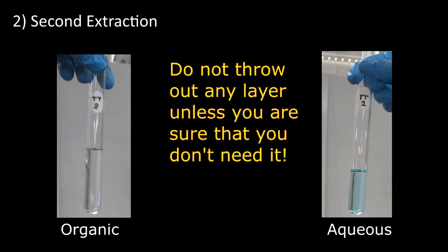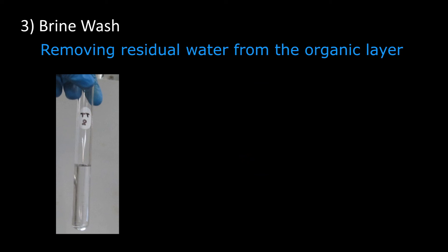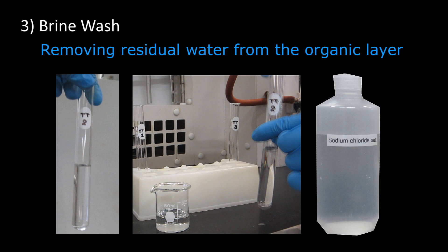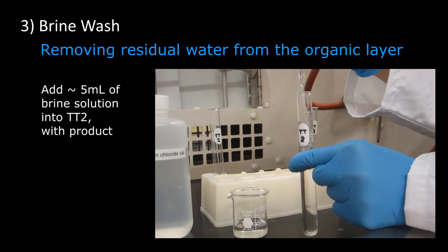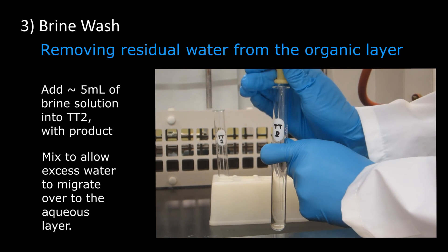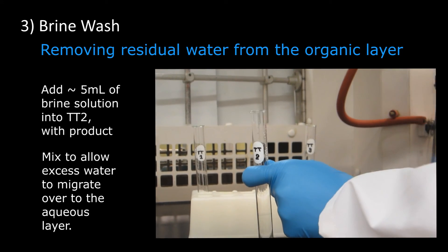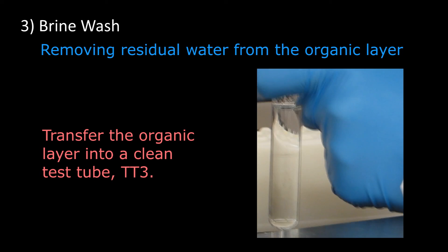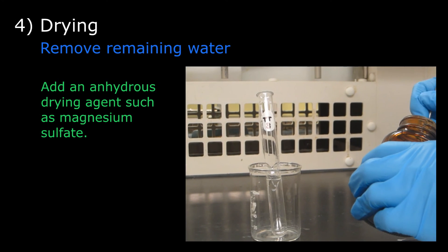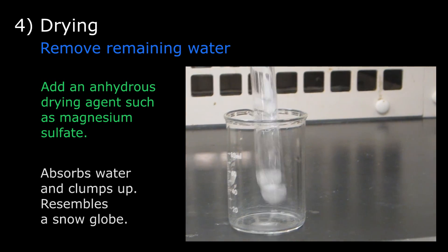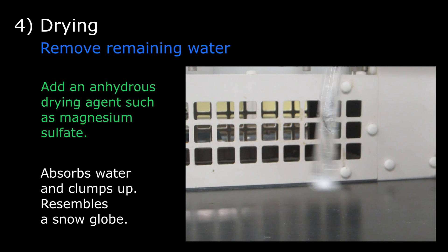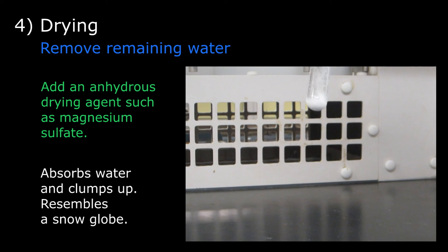This extraction step can be repeated to ensure that all of the product is isolated from the aqueous solution. Do not throw out any layer unless you are sure that you don't need it. Many organic solvents contain residual water. To remove the bulk of the water from the organic layer, it is rinsed with a saturated sodium chloride and water solution called brine. Add about 5 ml of brine solution into TT2 containing the product solution. After mixing, the excess water in the organic layer migrates over to the aqueous layer to establish equilibrium. Transfer the organic layer containing the product into a clean and dry test tube, TT3. To remove any remaining water, an anhydrous drying agent is added, such as magnesium sulfate. Add a spatula tip of the drying agent and swirl. The magnesium sulfate will quickly absorb the unwanted water, creating clumps in the flask. Once at least some magnesium sulfate is free flowing, no more needs to be added.